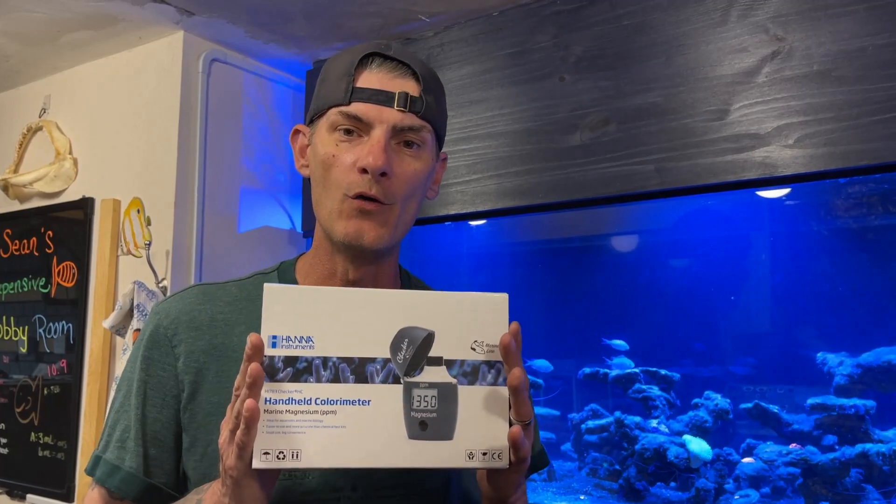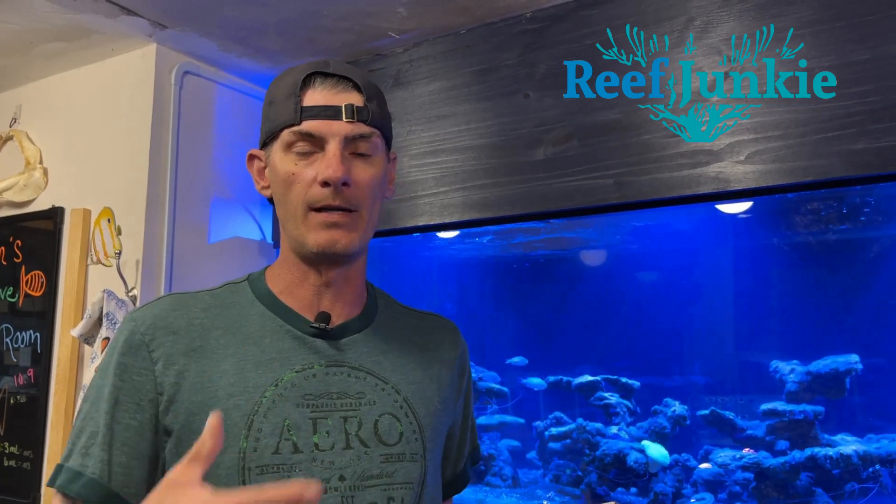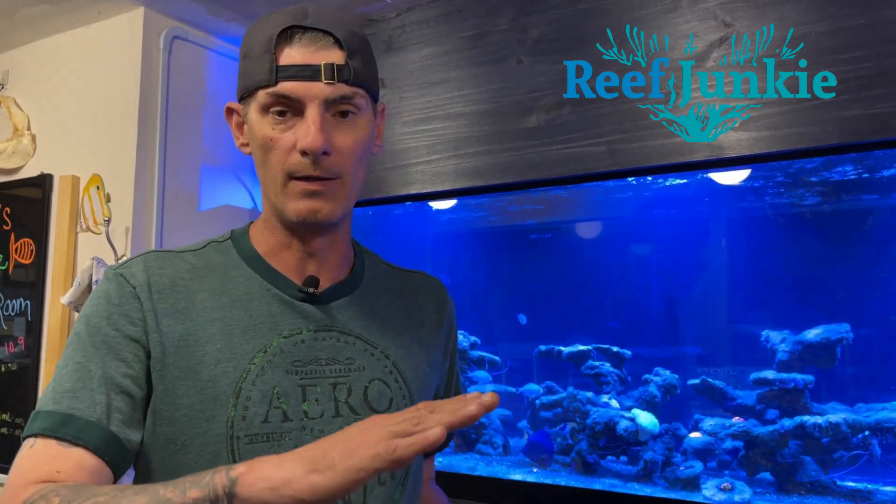Welcome back fellow reefers. Today we're going to take a look at Hannah's brand new magnesium checker. We're going to do an unboxing and go through how to use it. I may have to do a voiceover — we have to read the directions, this is our first time using it ourselves. We'll probably come back later and do an in-depth how-to. Just kind of excited — I want to show everybody if this is accurate or not. I haven't checked my magnesium in a long time, so let's get on with this.